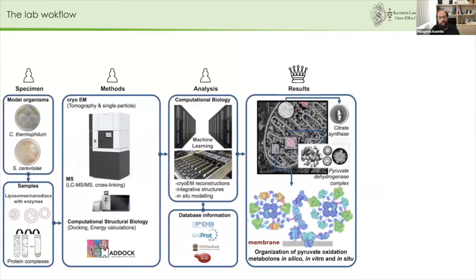And in particular, this is the lab workflow that I have established from 2018 when I came to the University of Halle-Wittenberg here in Germany. What we do is that we start with our model organisms, Chaetomium thermophilum, a thermophilic fungus, and yeast, and from here we are isolating different kinds of samples like soluble and membrane extracts.